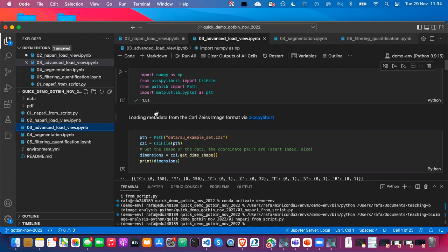You said that you can construct a function call that corresponds to all the UI elements, right? Yes. And then I guess when you set the UI element to some value, can you also get a function call that has all of that already put in?